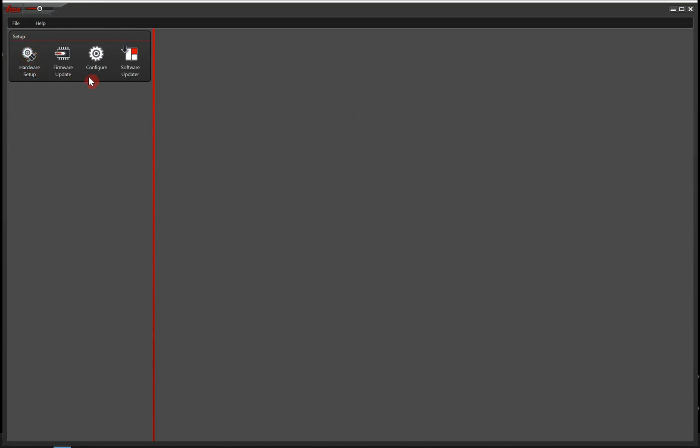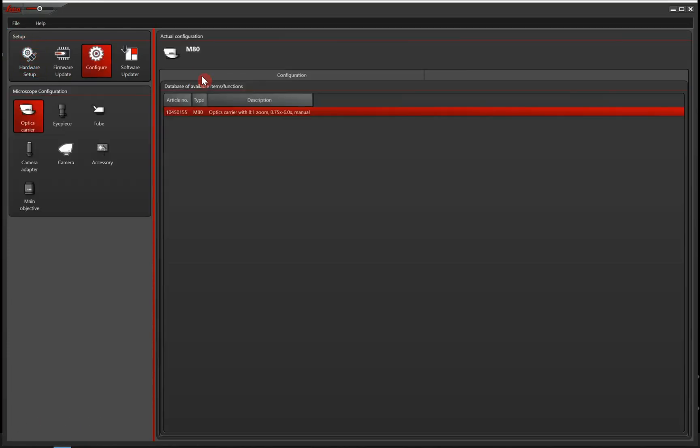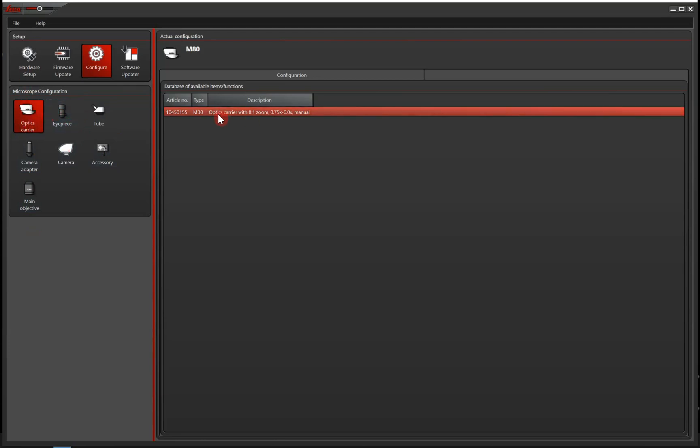We can then move on to configure. In the configure tab, we have a bunch of different parts that we need to tell the software which ones we are using. For starters, there is the optics carrier that we already showed in the hardware setup, but you still see it here. You can see that it's correct. It's the M80.